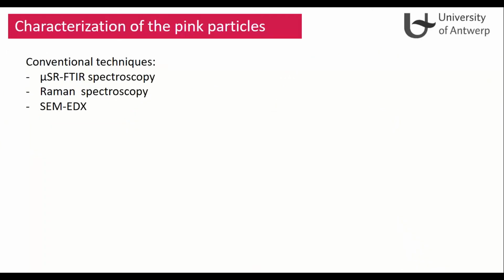Having characterized the matrix of the painting, the second stage was to characterize the pink particles. For this, we started with conventional techniques: synchrotron IR, Raman spectroscopy, and scanning electron microscopy with energy-dispersive X-ray, SEM-EDX, to have a first approach to the composition of these pigment particles.